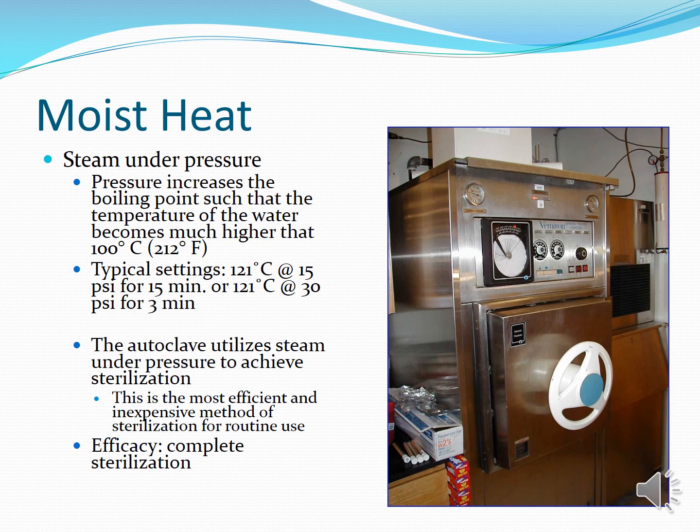Next is steam under pressure. Pressure increases the boiling point, so the temperature of the water becomes higher than 100 degrees Celsius.